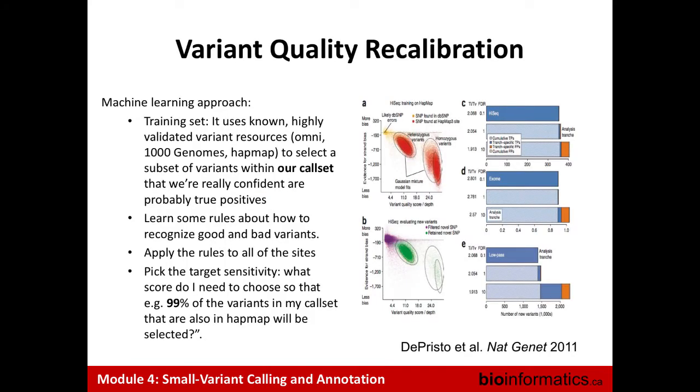And is there specific information you're extracting from the VCFs? What are your features? That's one of the main disadvantages: you don't know exactly what features have been used. I think you can dig a bit, but you don't have a clear set of features that you can use afterwards to redo it manually. Won't it throw it out, if you're extracting variants from these public databases? Isn't the algorithm going to expect your data to have certain information in order to run the machine learning algorithm? What sort of data is the algorithm expecting? It's the VCF from your sample, with the different information you have in your VCF, and the VCF of the other databases. So it's just what you need to have. Okay.